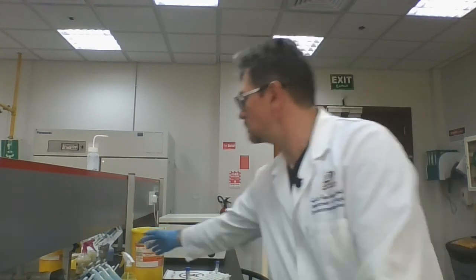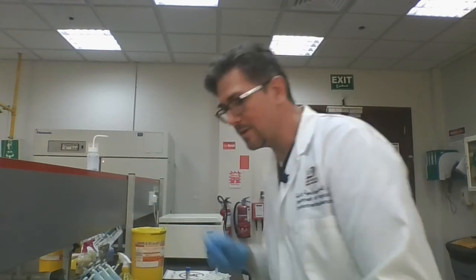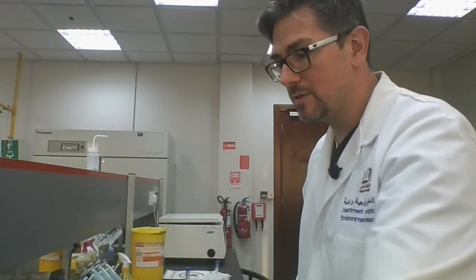Okay, so we're back. The spin is done. The spill is cleaned up. It was just a matter of wiping it up with some paper towels and wiping it down with some ethanol afterwards, or disinfectant. Disinfectant, okay?